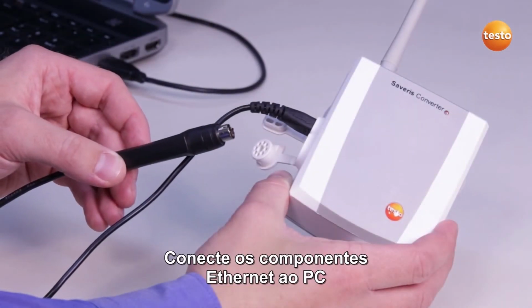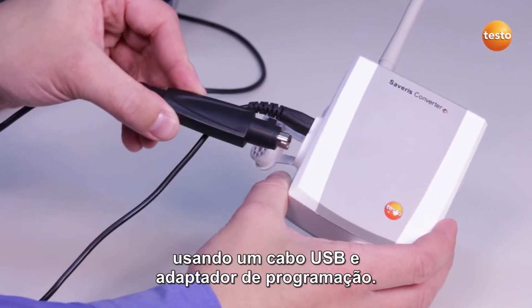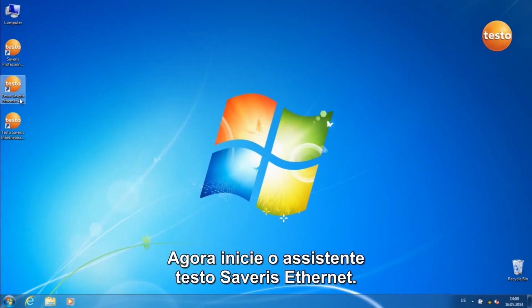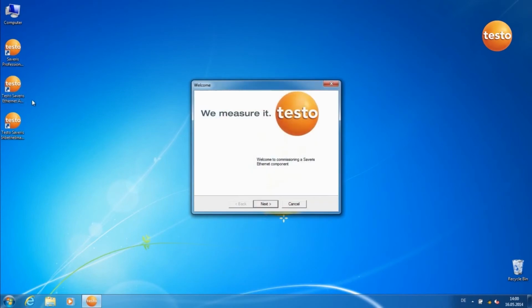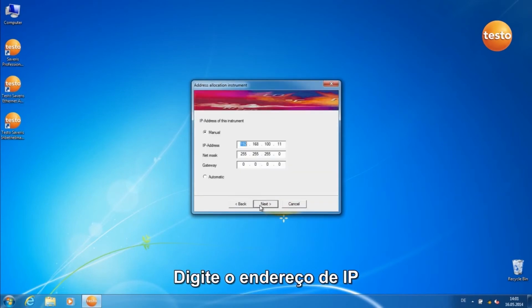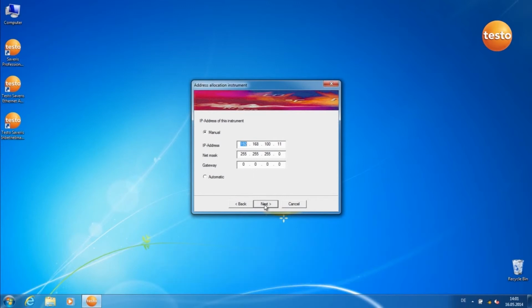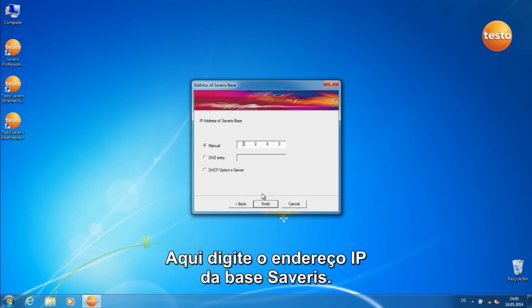Connect the Ethernet components to the PC using a USB cable and programming adapter. Now start the Testo Saveris Ethernet Assistant. Enter the IP address, net mask and gateway of the components. Here enter the IP address of the Saveris base.